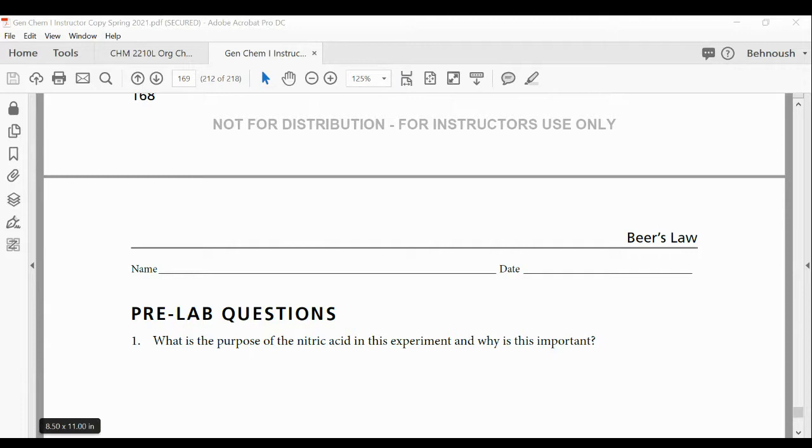For example, one of the course competencies for students in 1045 is to understand what a calibration curve is. So I designed an experiment that would show how to construct a calibration curve. I give an example of a calibration curve and all that. In general, you don't have to go into detail. It's just what the good points of this overall course were during the semester.